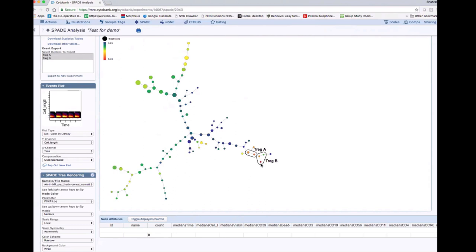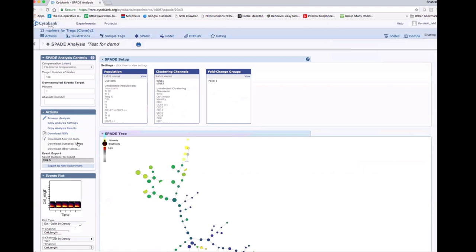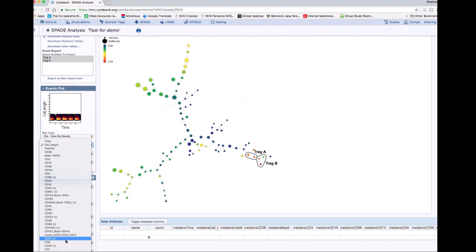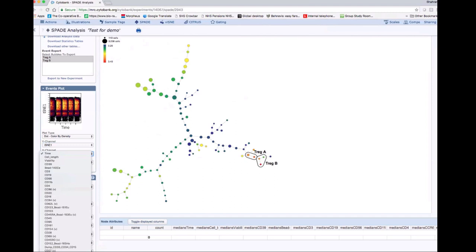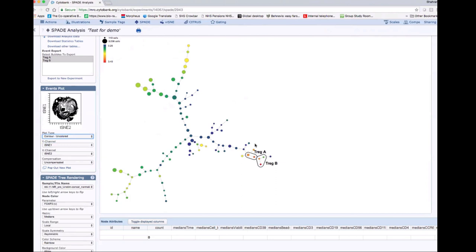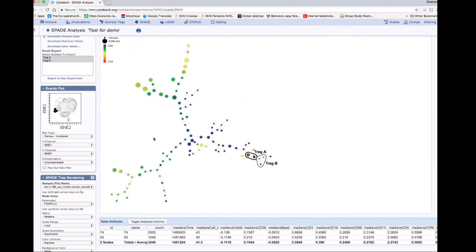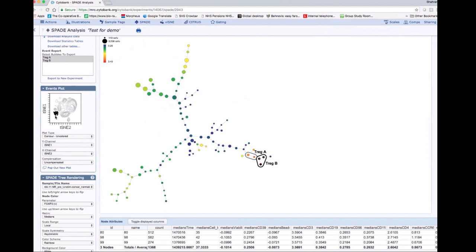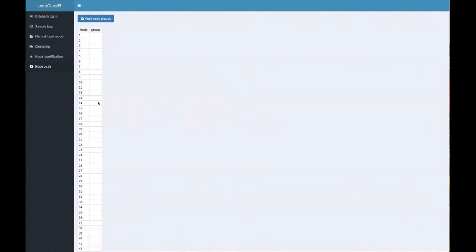Our SPADE tree is now updated with Treg A and Treg B subpopulations. We can also check the spatial separation in viSNE by selecting the viSNE dimensions — Treg A is in one part of the viSNE map and Treg B is in another part, so the subpopulations we identified are also spatially separated in the viSNE map.